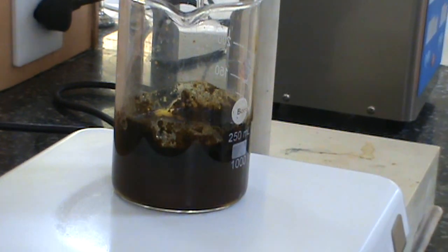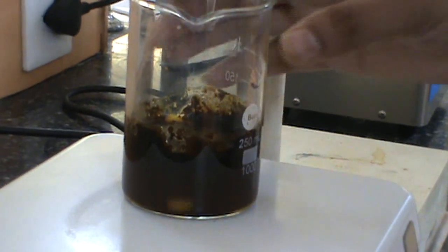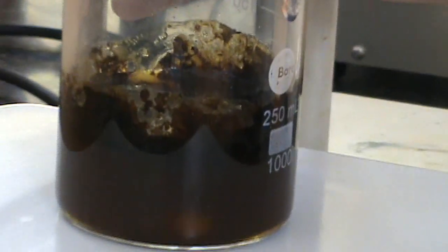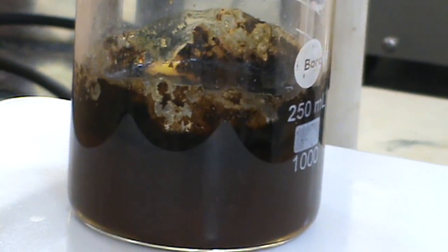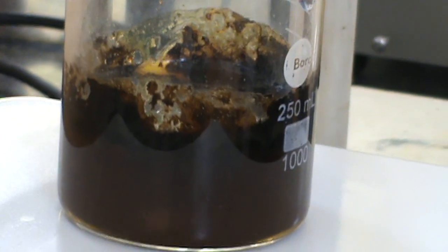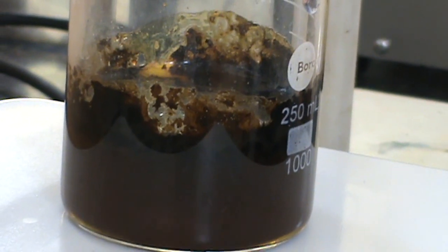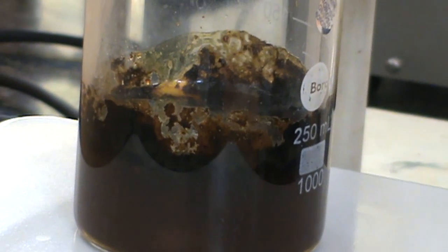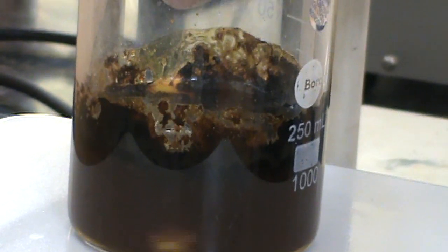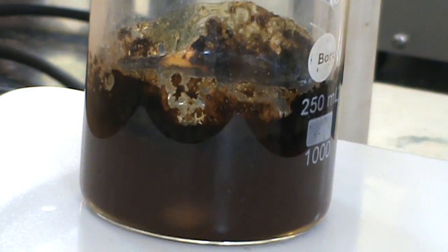Black precipitate has already formed. We will continue the stirring for some time, after that we will filter out the iron oxide nanoparticles, and then we will see the effect of magnet on these.